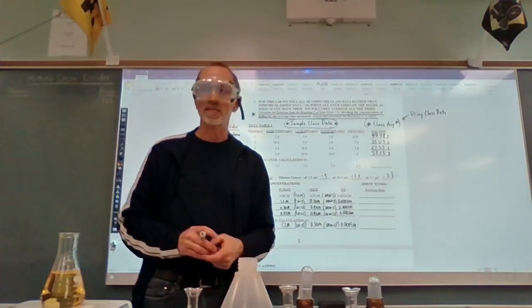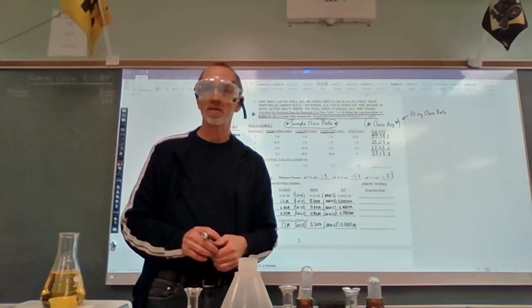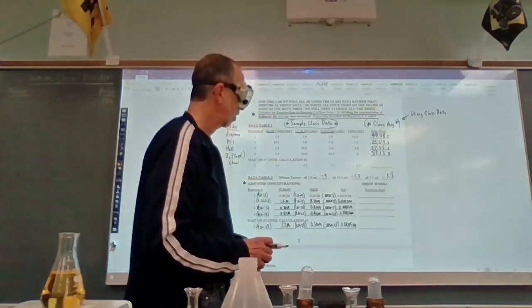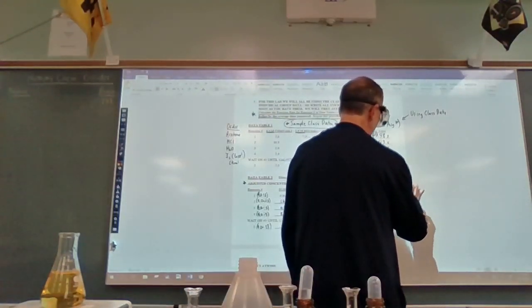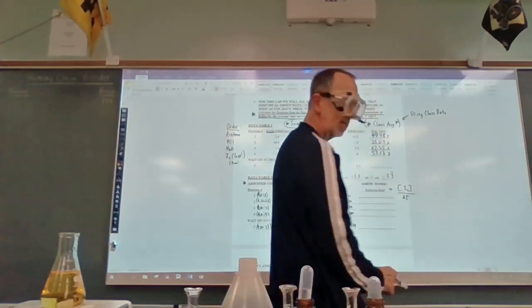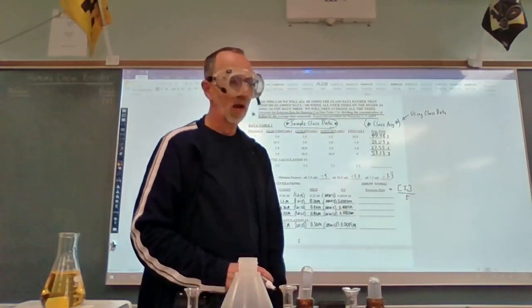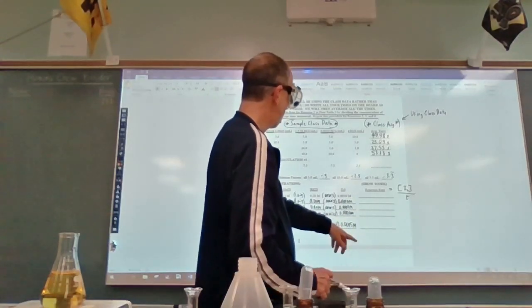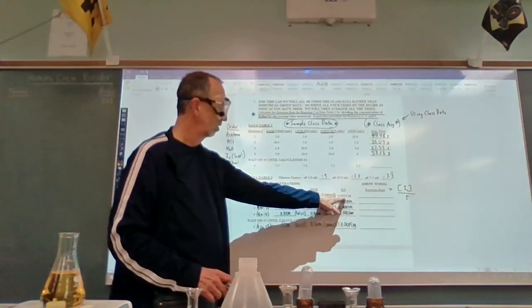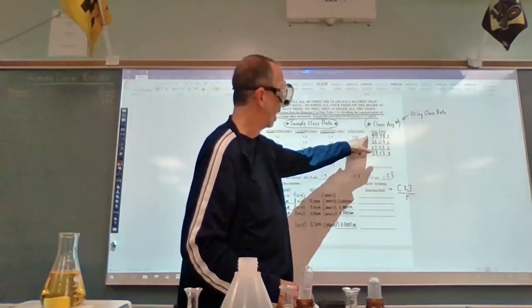Iodine is the clock, and so again, we're going to be utilizing its concentration as our benchmark for determining reaction rate. So then the rate would be the iodine concentration over T, all right? Yes, it's not really delta T, it's just T. All right, so for this first one, our iodine concentration is right here, 0.0010, and our time was 49.9 seconds.